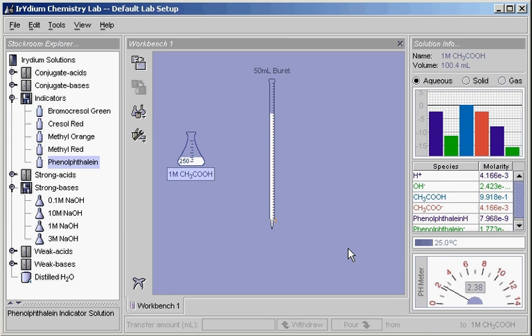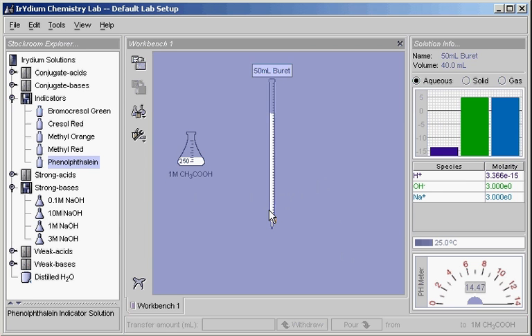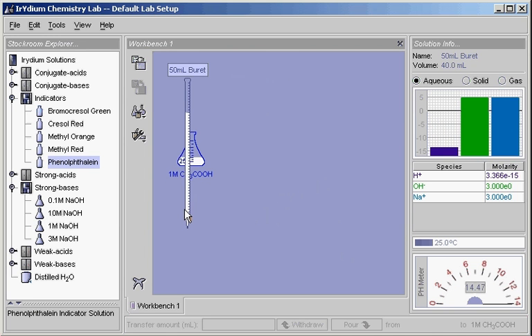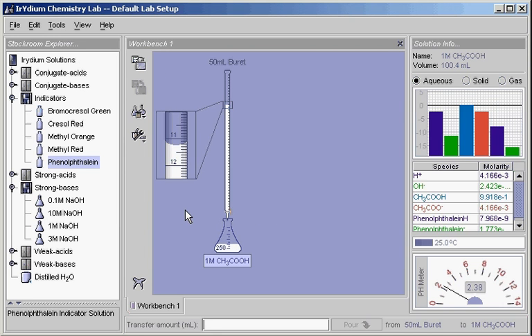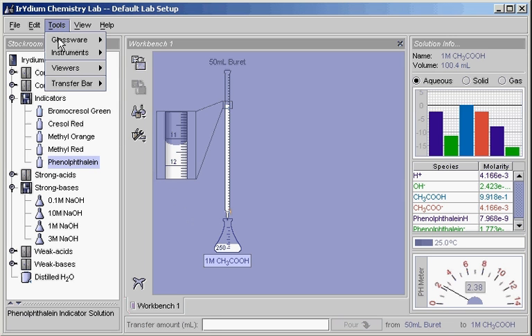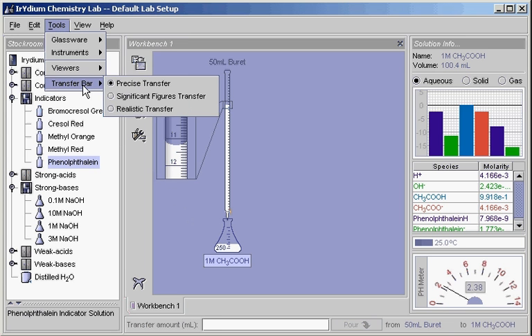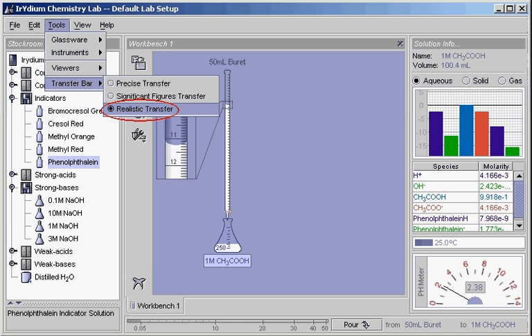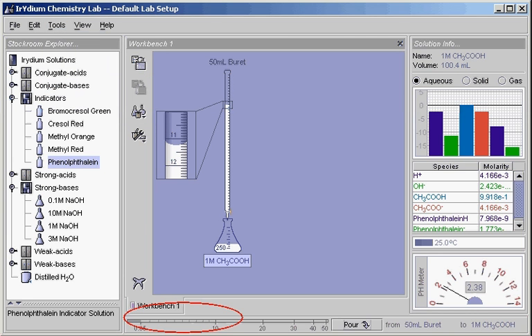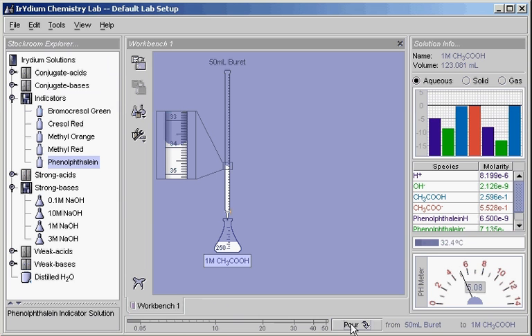To begin the titration, drag the burette onto the flask. There is another way to transfer solutions. Under the tools menu, switch the transfer bar option to realistic transfer mode. Note that the field for entering numbers on the bottom has been replaced with a scale of numbers. Holding down the pour button makes the purple bar move across the number line, showing how much is being poured from the burette. Note the changing pH.